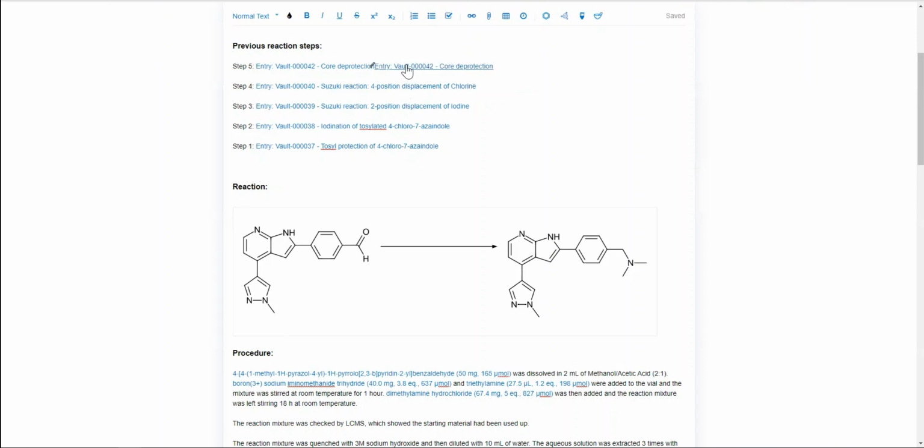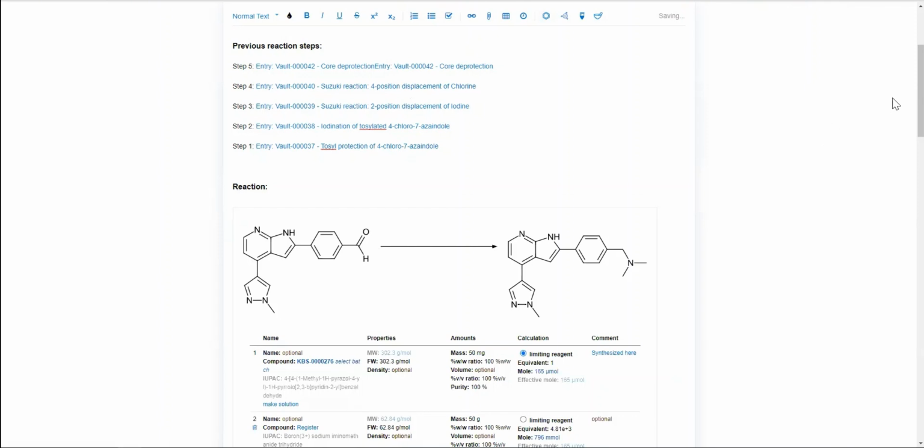In addition, as a full chemistry ELN, you can click on the benzene icon in the toolbar and import or draw your own structures or chemical reactions. If you draw a chemical reaction, we will automatically recognize that and populate a stoichiometry table for you.